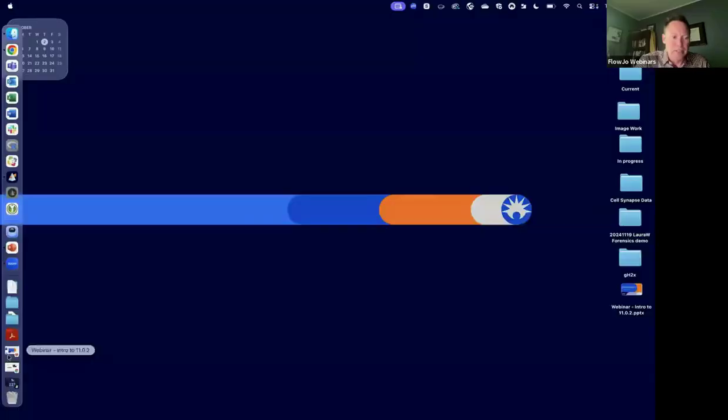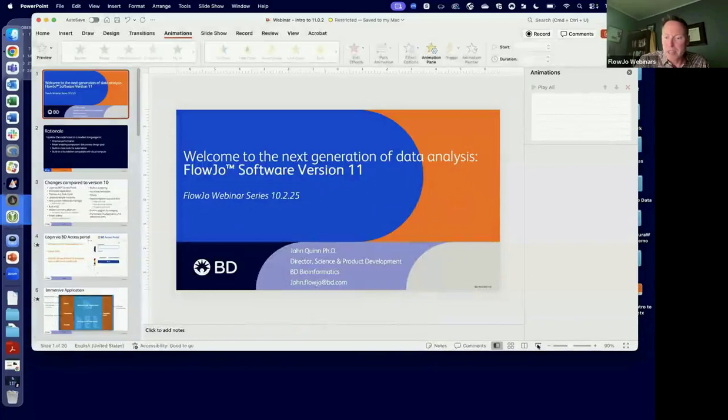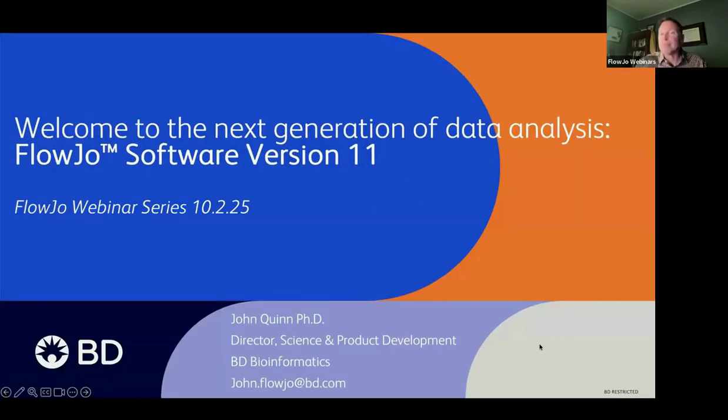We are prepping for the release of 11.1 later this month. Should be right about at the end of the month. And so this will be the last webinar on 11.0.2, and at the end of the slides I'll show what features 11.1 is going to get. So without further ado, let's share a screen and do some slides.